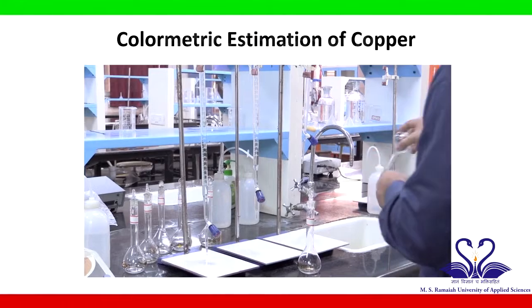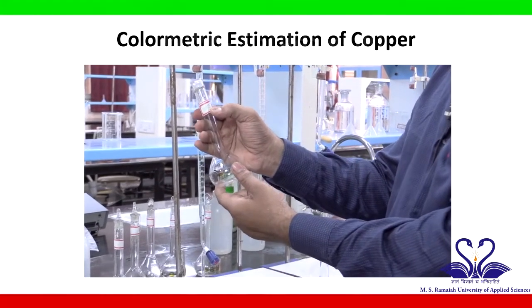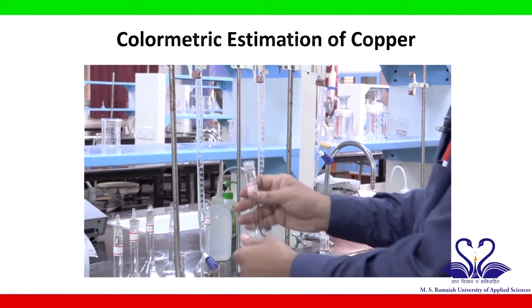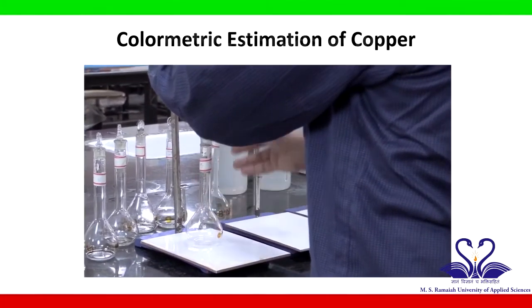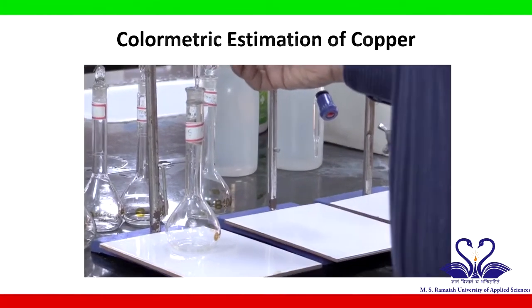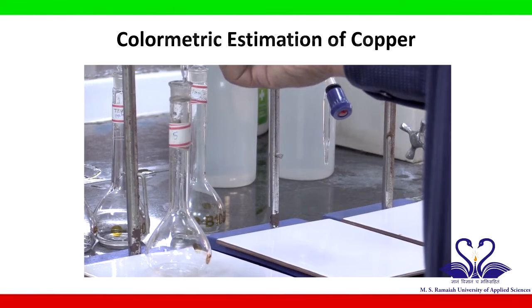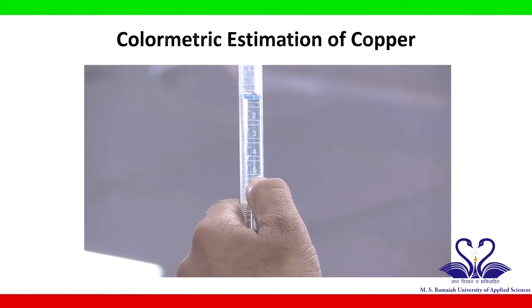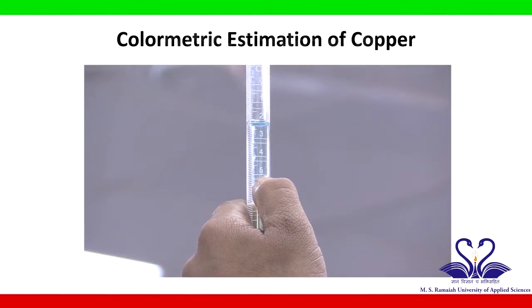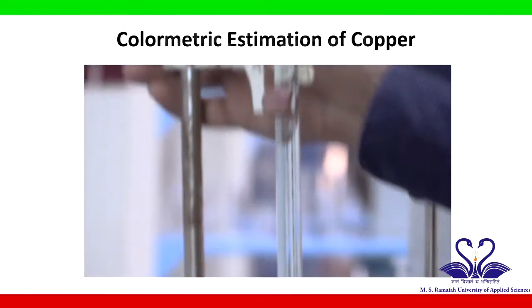So you can mark it as you are using 5 ml of copper sulfate in this. So I have made the mark as 5. Now I have to take 5 ml of copper sulfate to this solution. So 5 is here. So add it. To start from 0, add it up to 5 ml. Carefully you can hold it in the hand. The left hand should be with the mark. The 5 ml is there. So done. So you can adjust the final one.